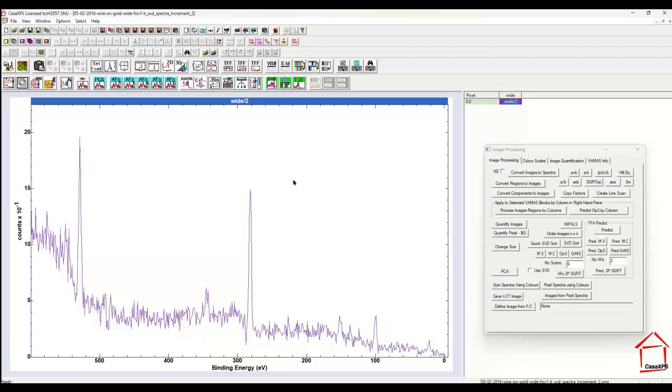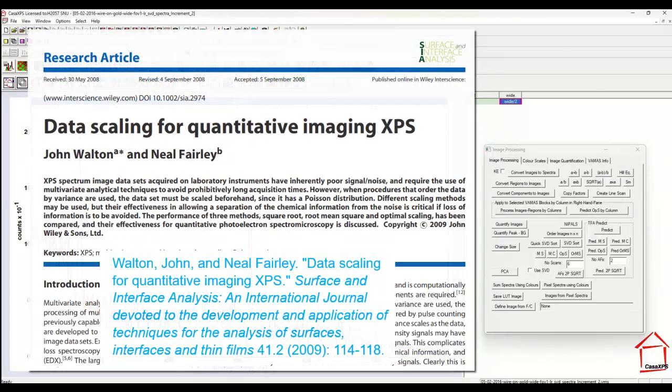There's a thin gold wire on the sample, and it is not significant enough when we have noise included in the calculation. So the use of optimum scaling, or any of these other 2 scaling options, is an attempt to reduce the influence of noise on the calculation.